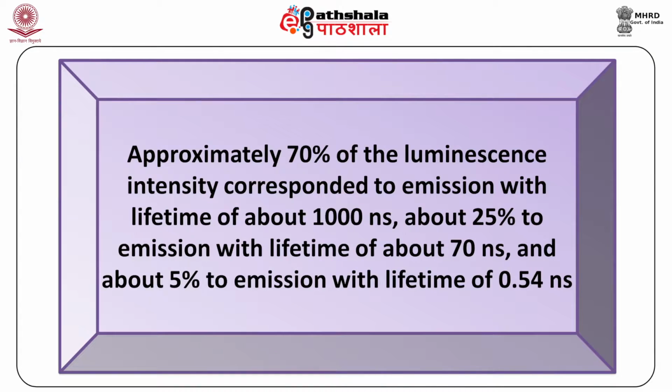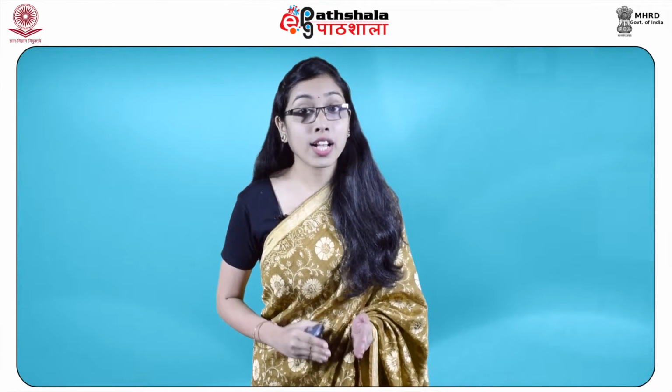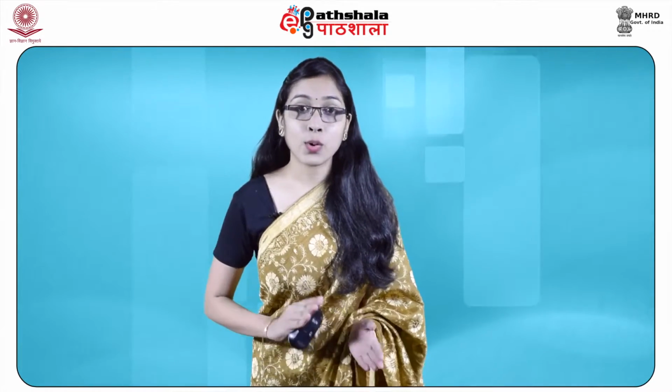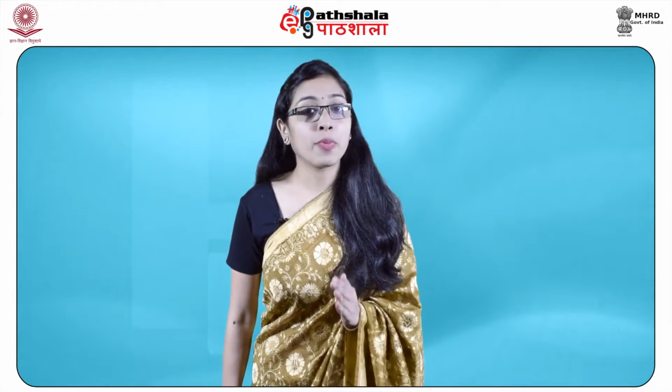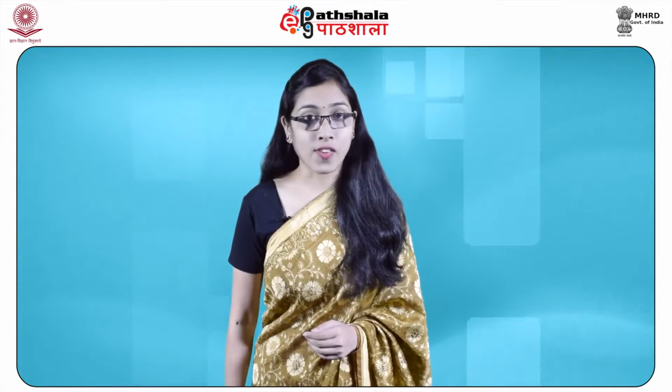Approximately 70% of the luminescence intensity corresponds to emission with a lifetime of about 1000 nanoseconds, about 25% to emission with a lifetime of about 70 nanoseconds, and about 5% to emission with a lifetime of 0.54 nanoseconds. This latter is excitonic emission, and the obtained lifetime is in good agreement with the literature. Total luminescence lifetime was measured rather than the lifetime at a particular wavelength or set of wavelengths, because fingerprint luminescence imaging usually involves the total luminescence.